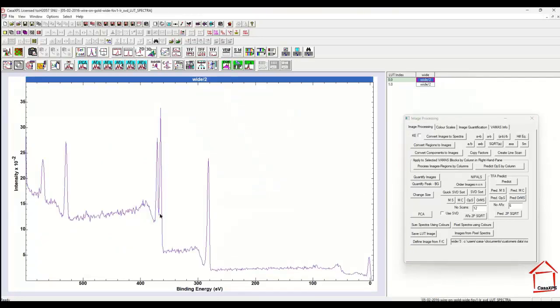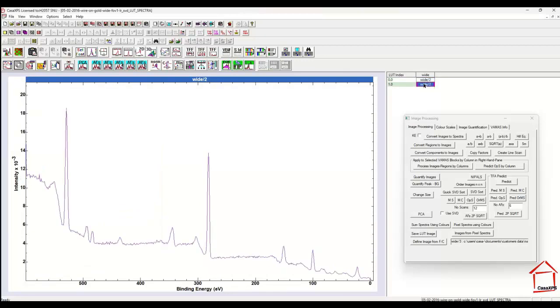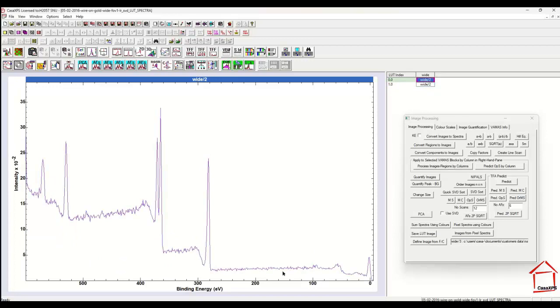And there we have one part looks like the silver dag, and the other part looks like that which is not silver dag. A little bit of silver here, so I didn't entirely partition the two sets, so we may need to do a little bit of more work on these data, but nevertheless I've achieved now a spectrum that looks very much like silver dag.